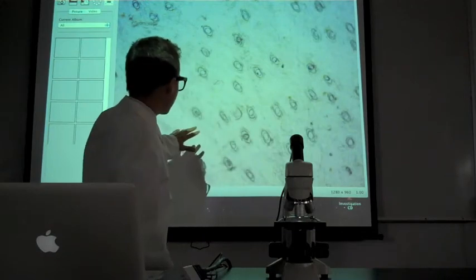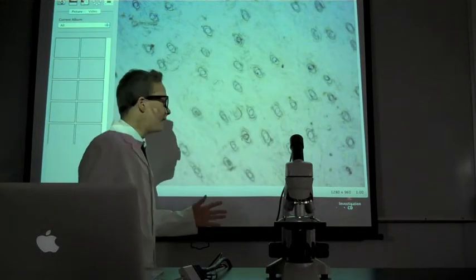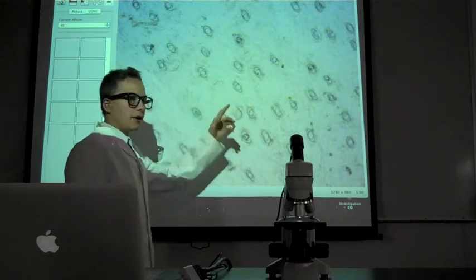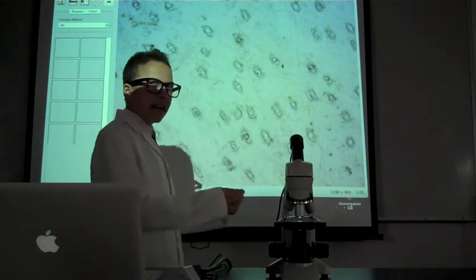In the section behind me, we see the stomatis, which is the underside of the leaf. These open holes allow air to come in and out of the leaf.